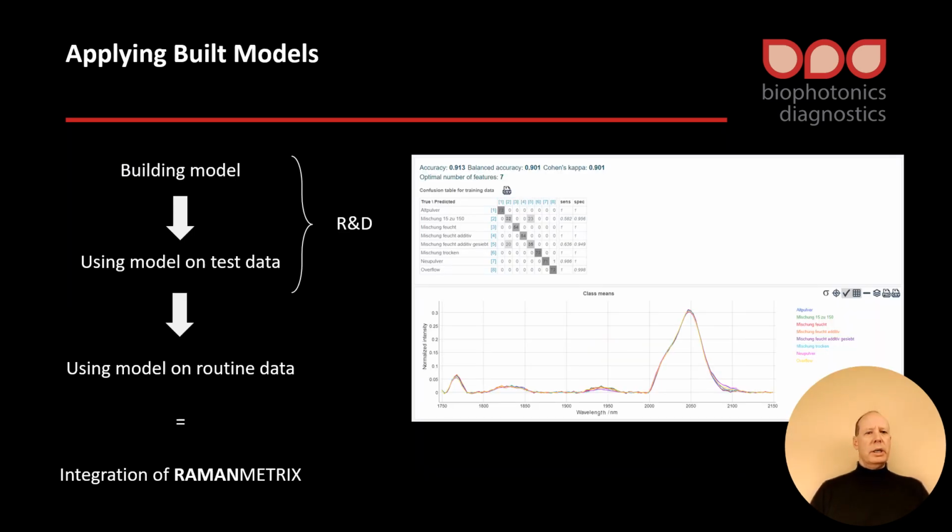The previous slides I was showing you were to show how easy it is to go through the whole data analysis pipeline step by step. And this has more of an R&D character because the focus is to find out the best pipeline settings and the best algorithm to analyze your data.